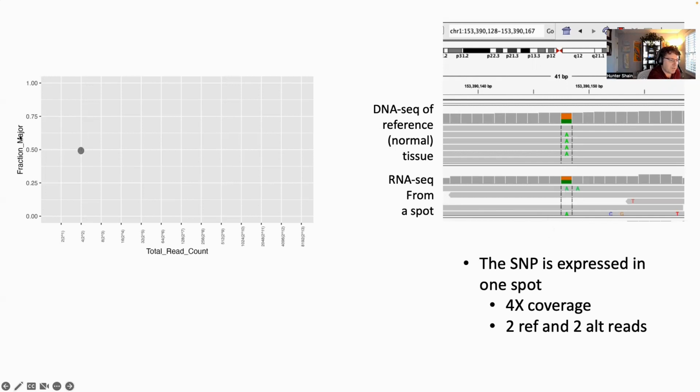of the reads mapping to what we defined as the major allele, but it's not necessarily important how you define which allele is the major allele. Now, I'm going to recommend that you plot the fraction of reads mapping to each allele as a function of coverage. So here would be 4x coverage, and I think this will become obvious why momentarily.